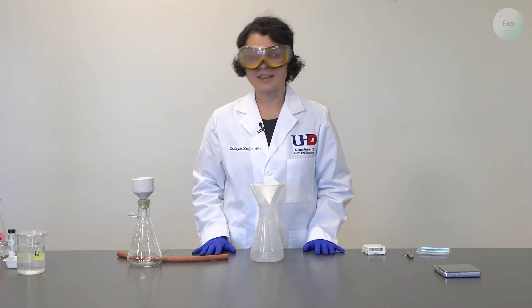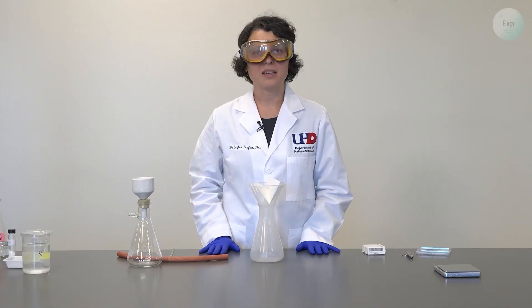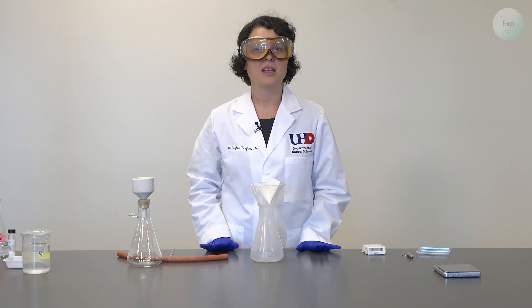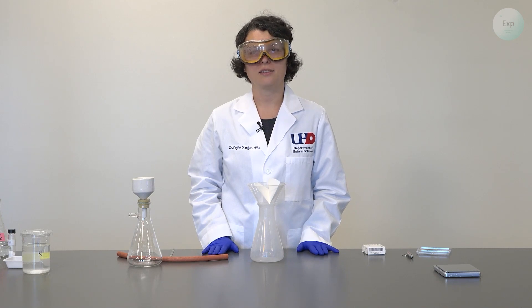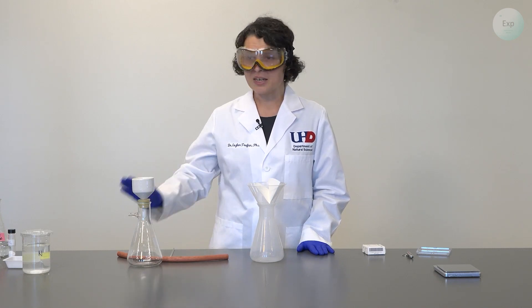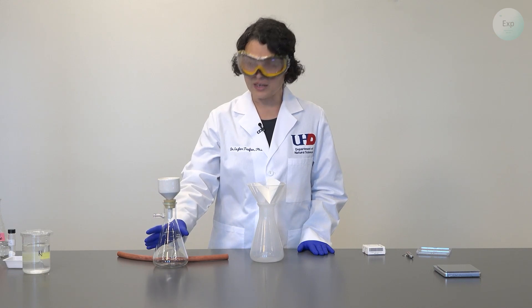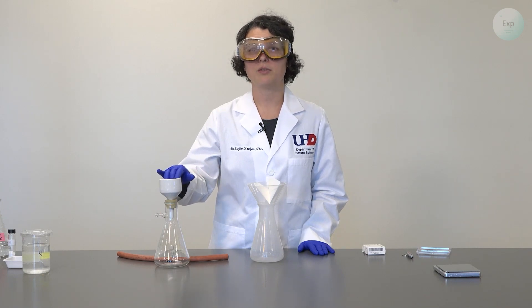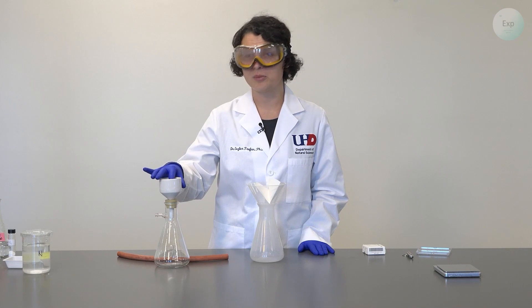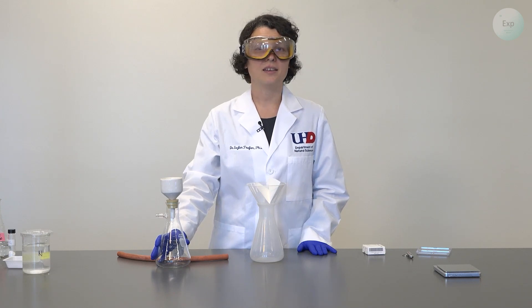With both setups ready, the next step is to filter our solution. An important consideration when making a saturated solution is that at the end of filtration, normally we would wash our precipitate, but in this case, because we are aiming for a saturated solution, it is crucial that we abstain from washing our solid. As soon as all the mixture goes through the funnel, we need to stop, because what we are looking for is the collection of the solution that goes through the filter paper. If we add more water, that is going to dilute our saturated solution and it defeats the purpose.